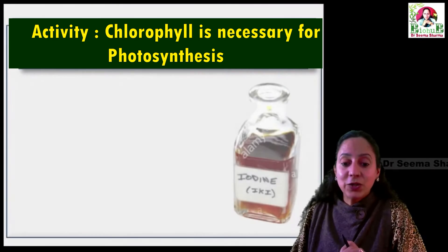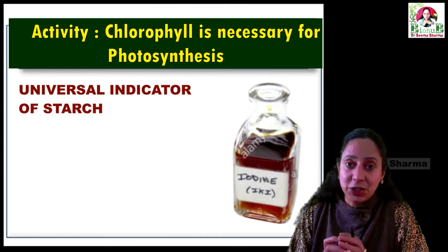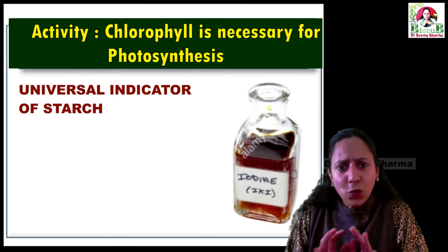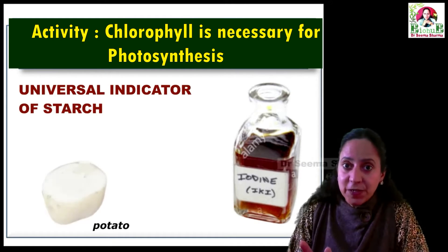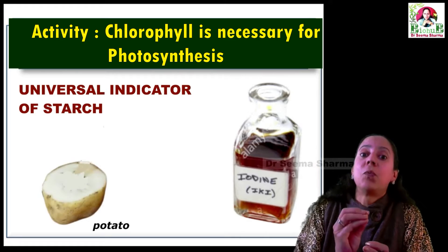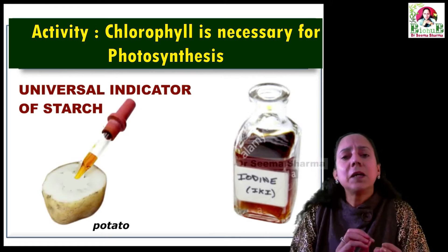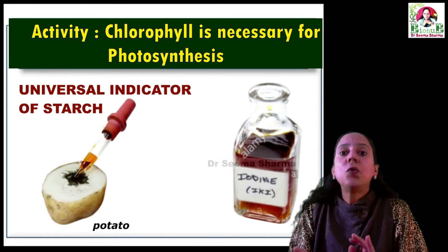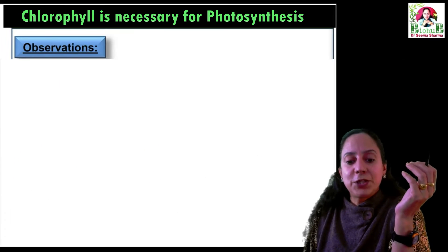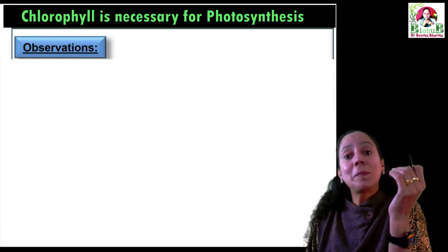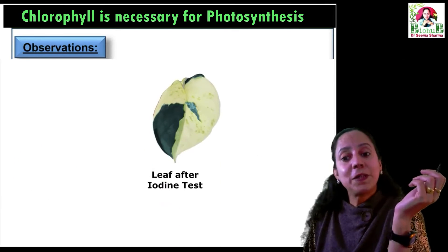Lastly, pour iodine over the leaf and note the color change. Iodine is a universal indicator of starch — in whatever material starch is present, pouring iodine on it will immediately turn it blue-black.